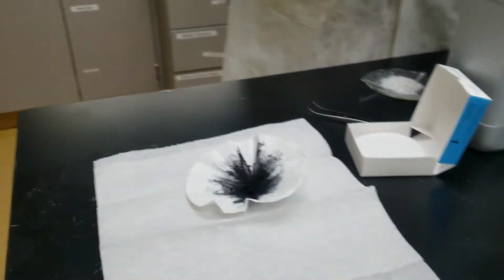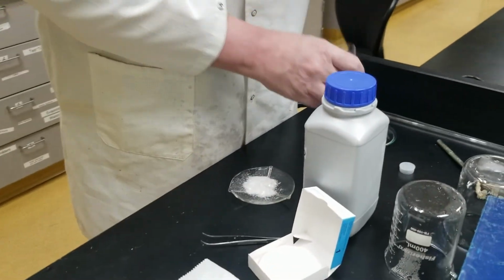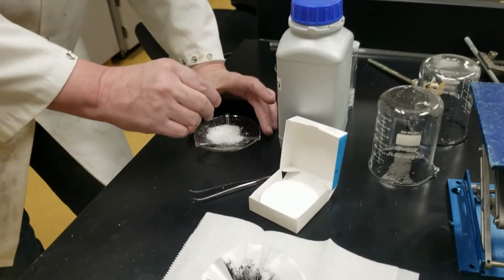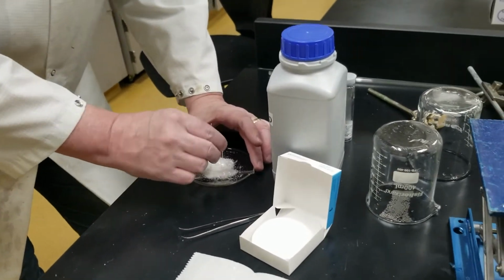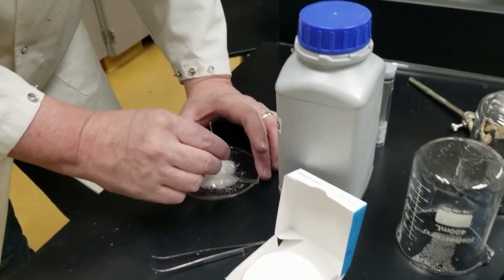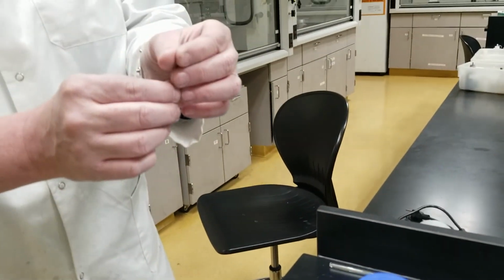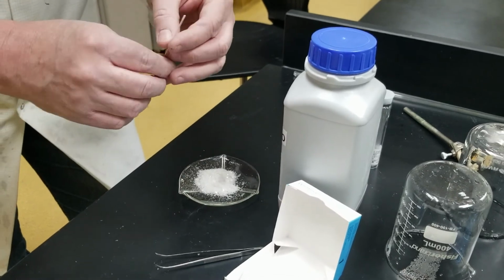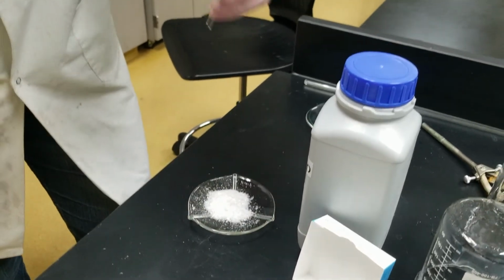You may remember that we did use acetanilide during the first melting point experiment. But then we recrystallized it later on in 241. I think this is a really classic compound to use in recrystallization experiments because of how pretty the product looks when it's purified, and how non-toxic it is. You can make mistakes, spill it all over you, and not have to worry about dying. That and the solvent's water as well.